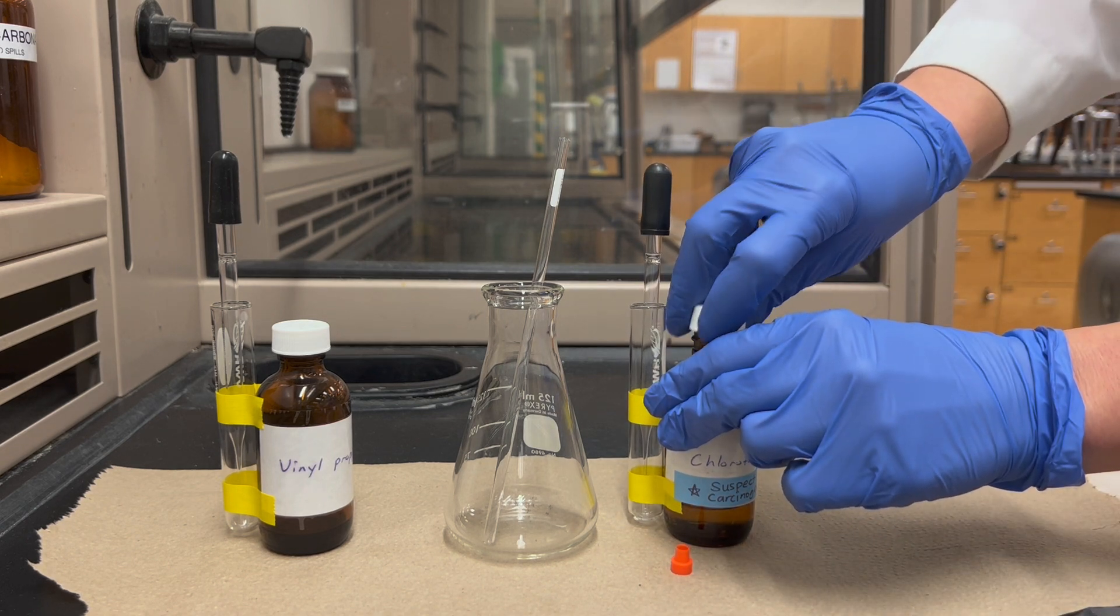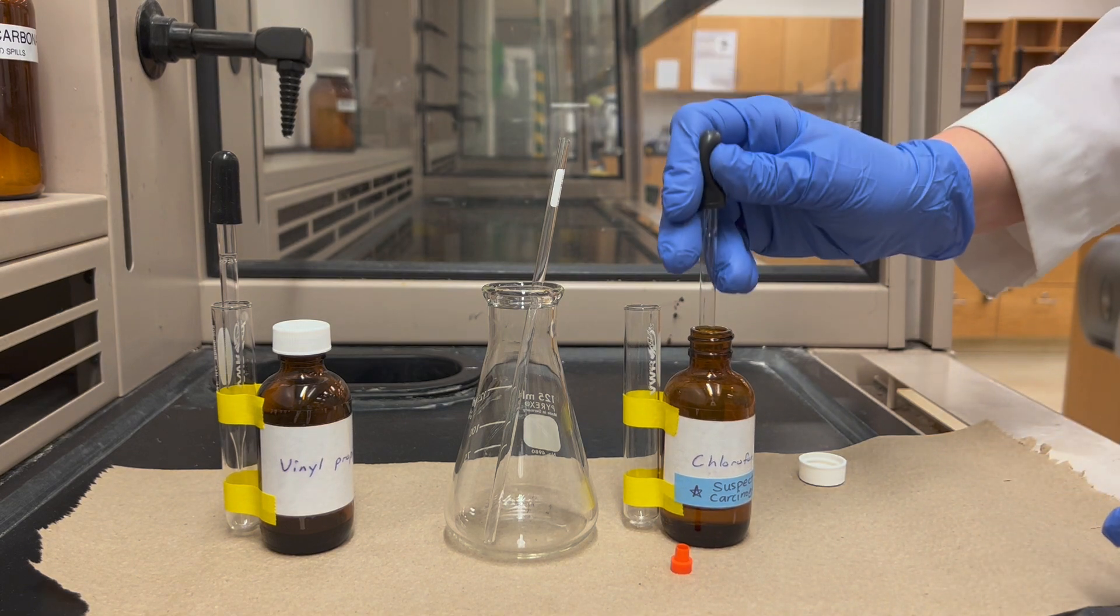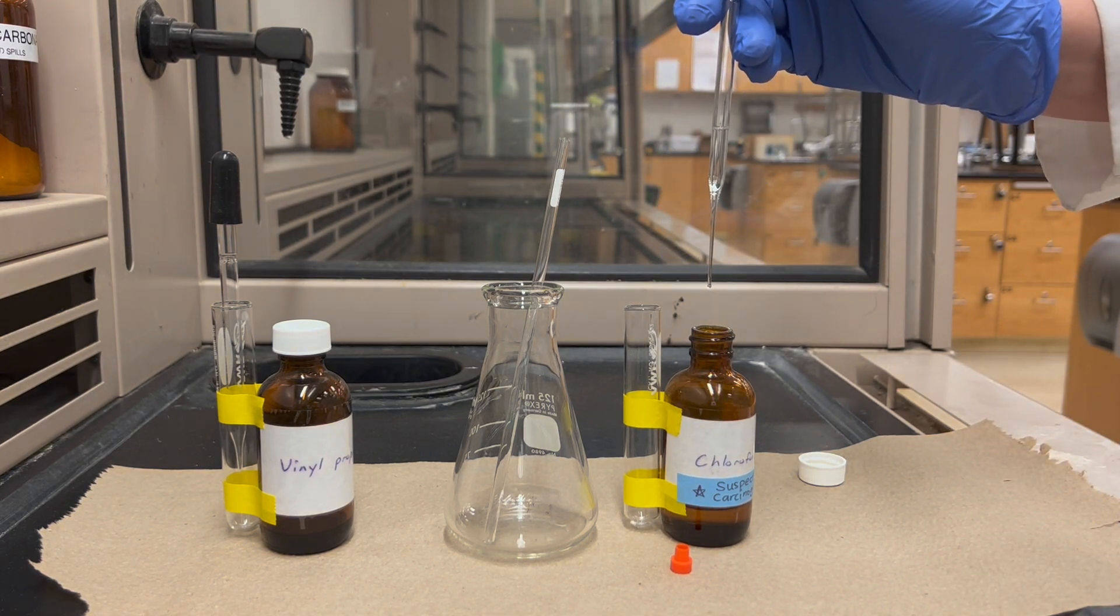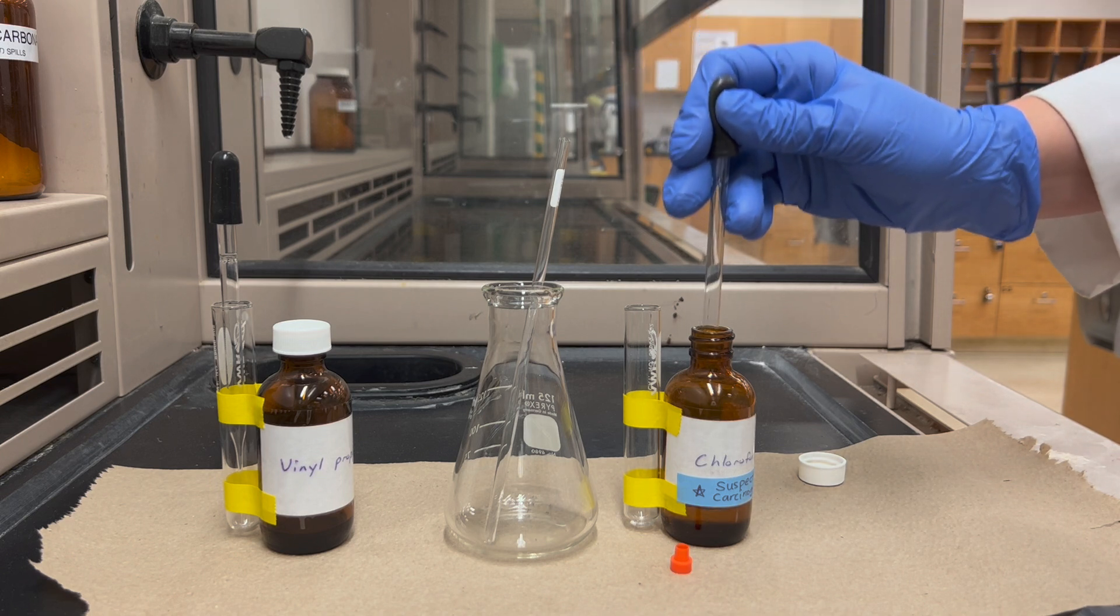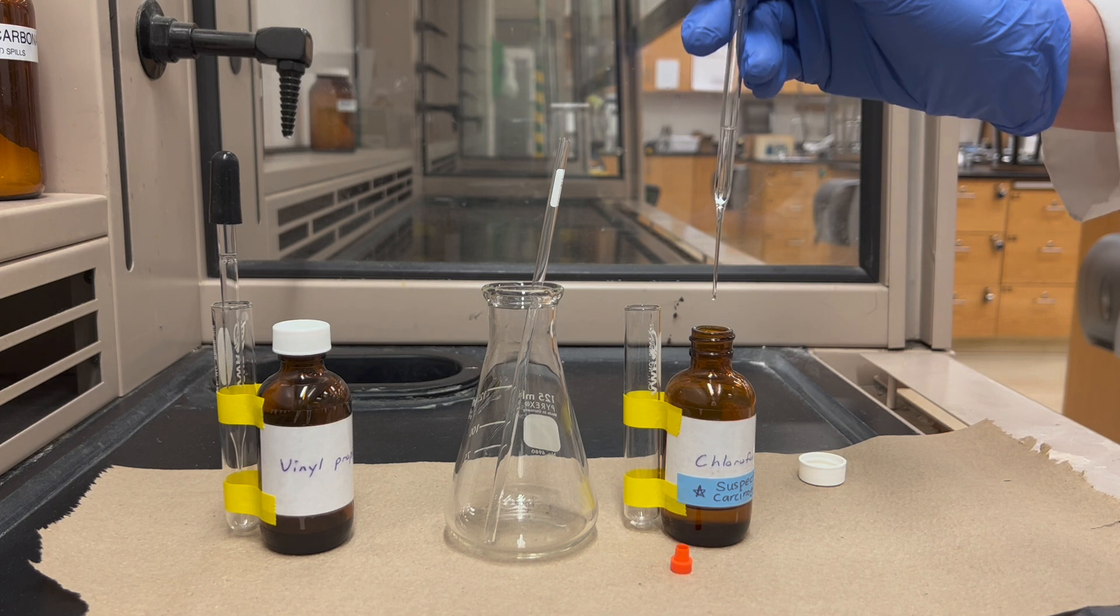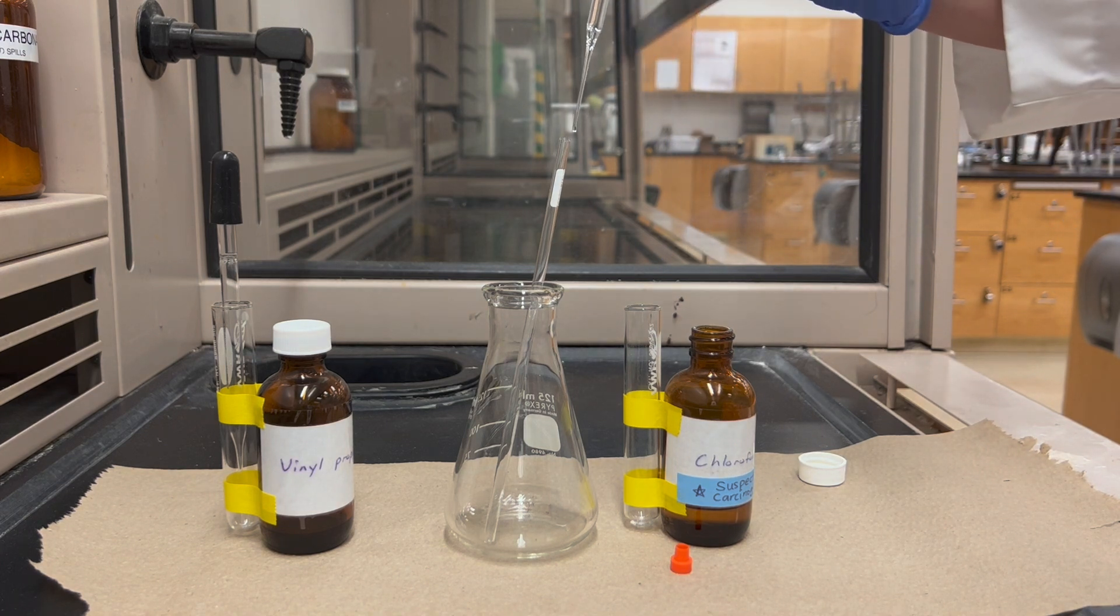Deuterochloroform also has a tendency to drip out of the pipette. If you notice it's dripping out on its own even without pushing on the bulb, one way to fix this is to withdraw and expunge the solvent a few times. By doing that you'll saturate the headspace in the pipette with vapors and it won't drip anymore.